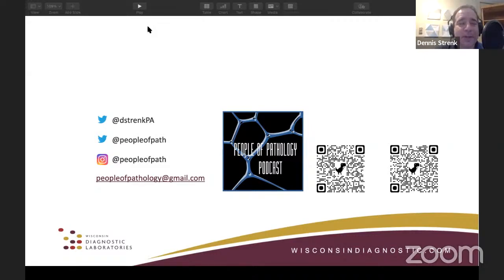For lumpectomy specimens in particular, we have a system that we use. There are 6 margins, so we have 6 colors, and the way that we remember it is superior is blue: superior is up, the sky is up, the sky is blue. Inferior is green, green is grass, so green grass, blue sky. We use black for deep or posterior because deep is often the most important margin and black is easiest to see.